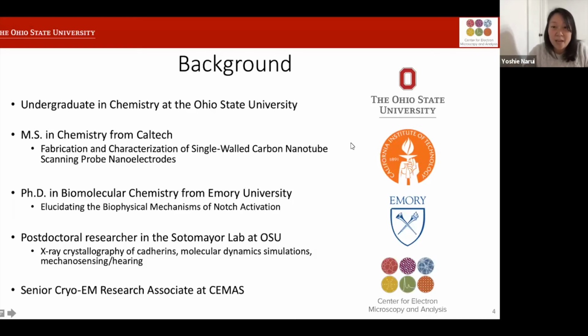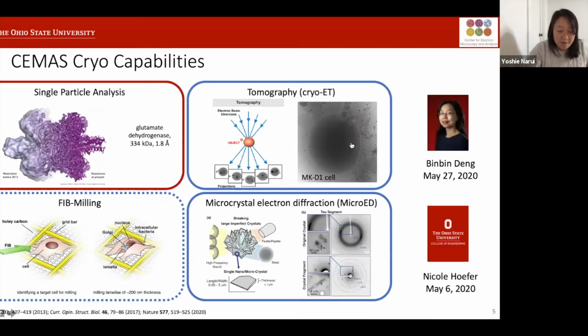Okay, so now to get more to the cryo-EM capabilities that we have at CEMAS. I've broken it down here into 4 different areas. The only area that I'm going to be talking about in depth today will be single particle analysis, the box in red in the upper left.